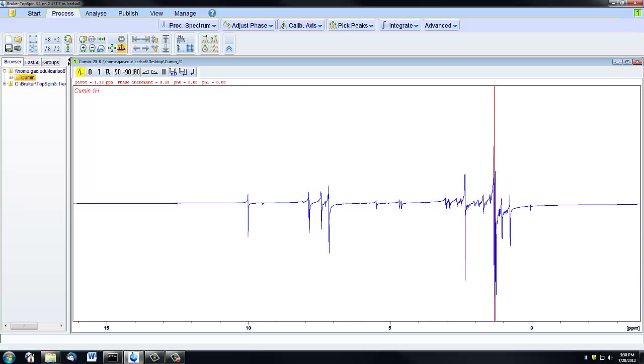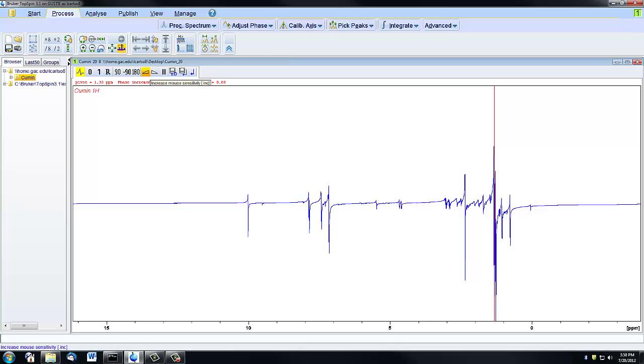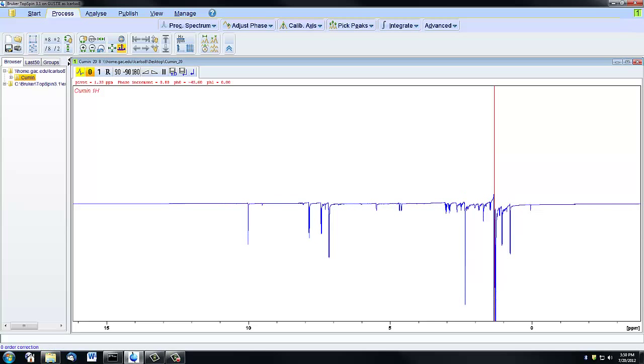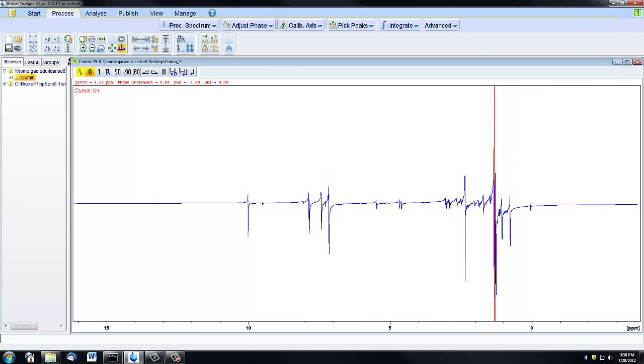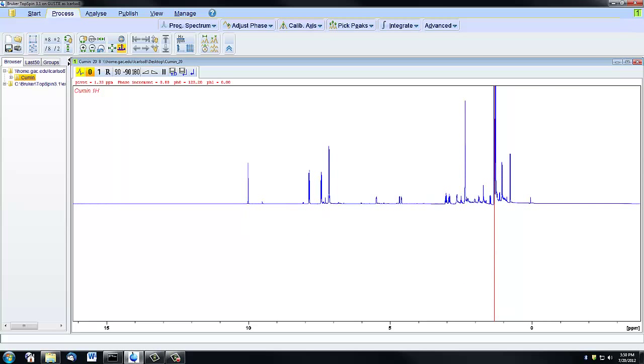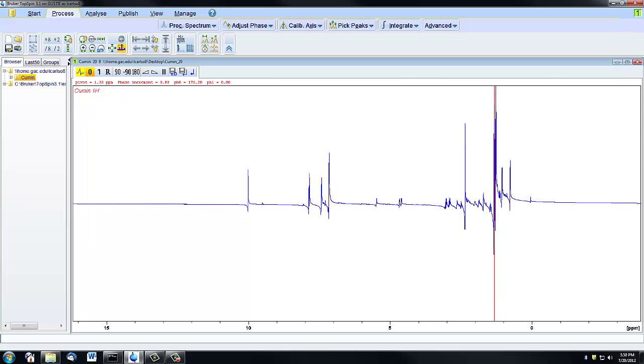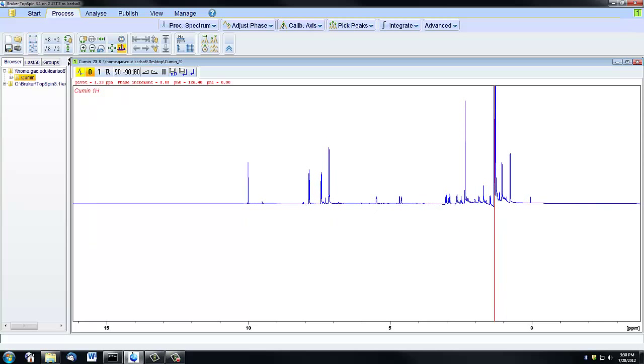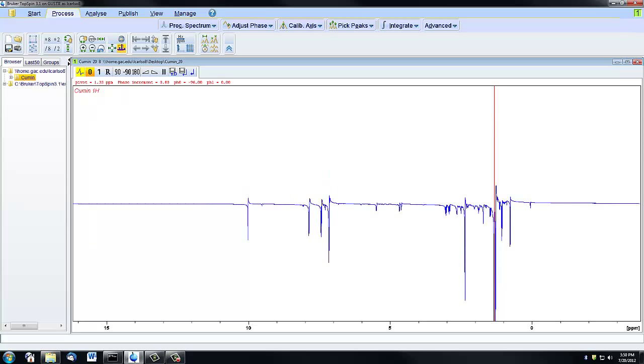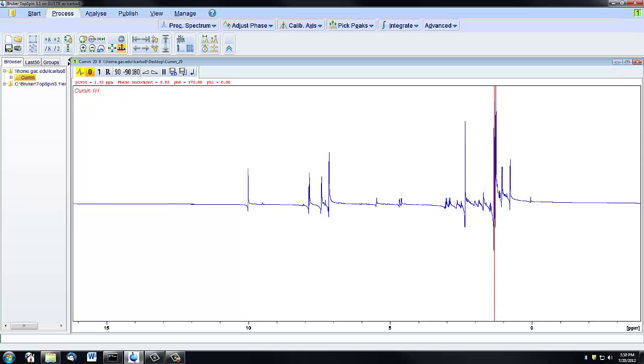There are a few other icons that are helpful in manually phasing a spectrum. This slope button here is going to adjust the sensitivity of the mouse. If I click on the upward slope a couple of times, that's going to make any movement that I make on my mouse move the spectrum farther. It's going to decrease the sensitivity of the mouse. Now when I'm moving on the zero correction, I'm not moving my mouse very much, but the spectrum is moving a lot.